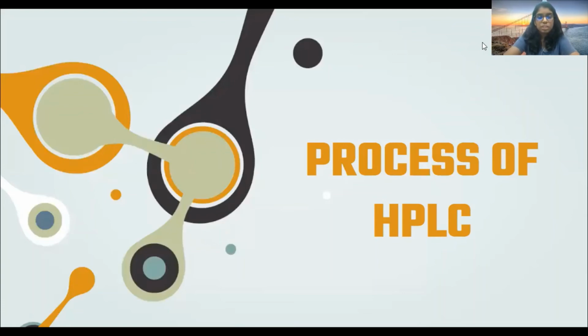Now, let's see the process of HPLC. Although gas chromatography is predominantly used for fatty acid analysis, HPLC is used in handling of less usual samples to avoid the degradation of heat-sensitive functional groups and also for micro-preparative purposes.